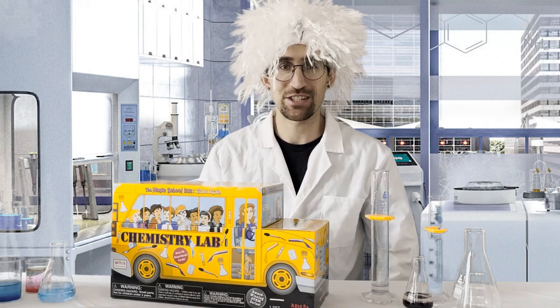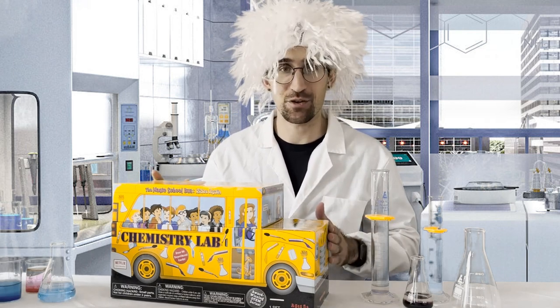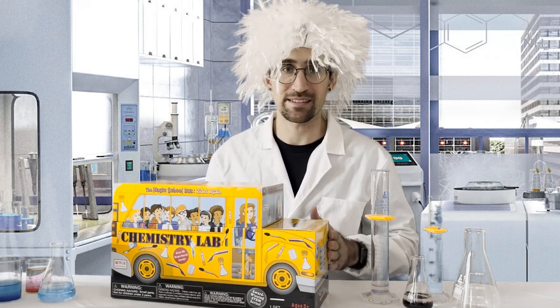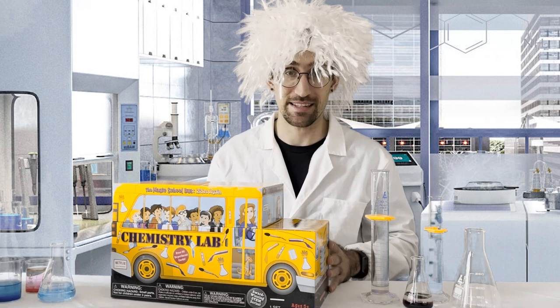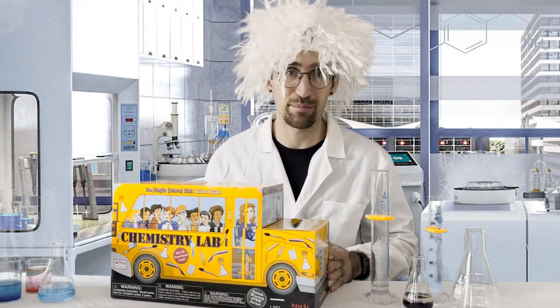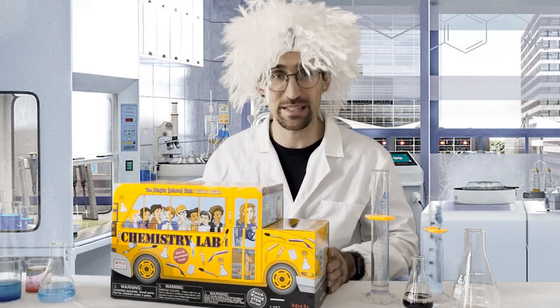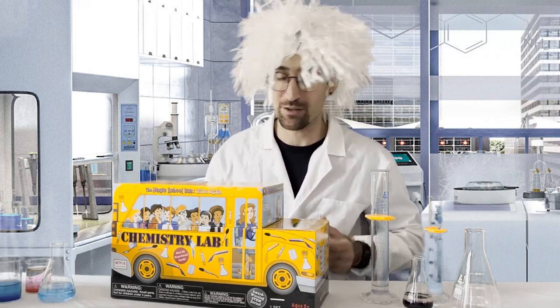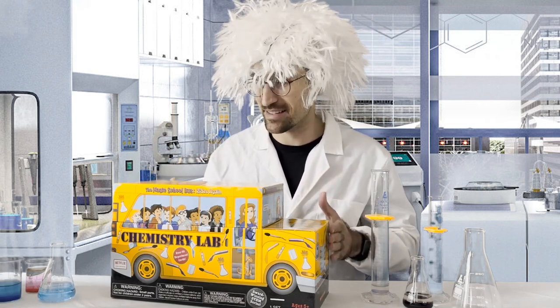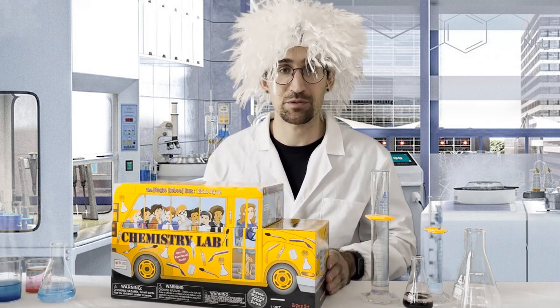Hello and welcome back to another teachkidschemistry.com video. Here I'm in the lab and I'm excited to show you this chemistry lab kit from the Magic School Bus Rides Again series, offered by Scholastic. This is an extremely great kit for boys and girls ages 5 and up, with a varying list of activities — over 50 different experiments that you can do using some household objects along with the objects found in this chemistry kit.